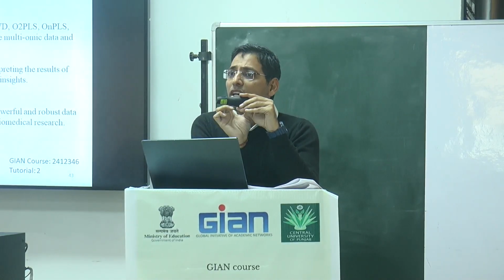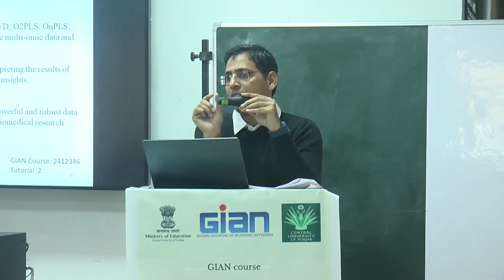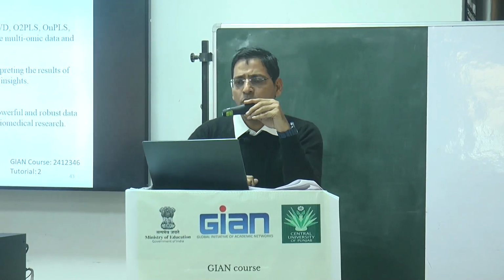But all those strongly bound, if you change the gradient, they will come after some time. They will give you another peak. So this is an affinity concept actually.